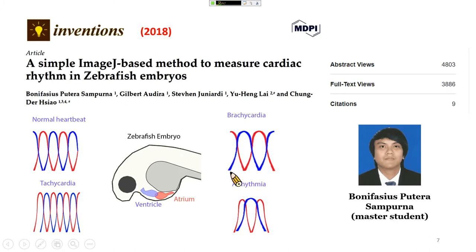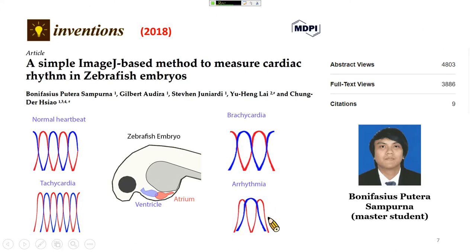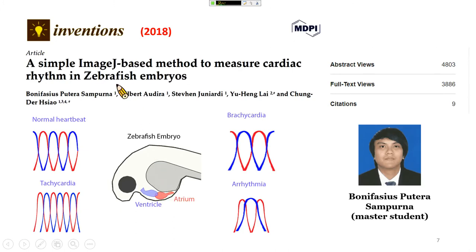The most serious condition is arrhythmia, where the atrium-to-ventricle ratio becomes two-to-one — we call this irregularity of the heartbeat. In this protocol, we use ImageJ to analyze the signal from the atrium and ventricle, and eventually we are able to quantify the cardiac rhythm.